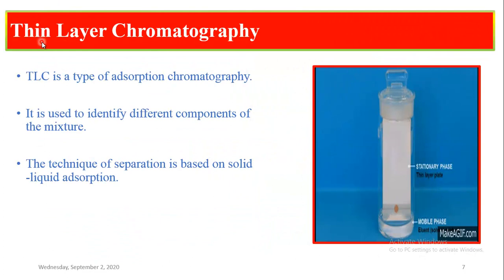So now I come to the topic, thin layer chromatography. It's a type of adsorption chromatography. It is used to identify different components of a mixture. This technique of separation is based on solid-liquid adsorption, meaning the solid is the stationary phase and the liquid is the mobile phase.